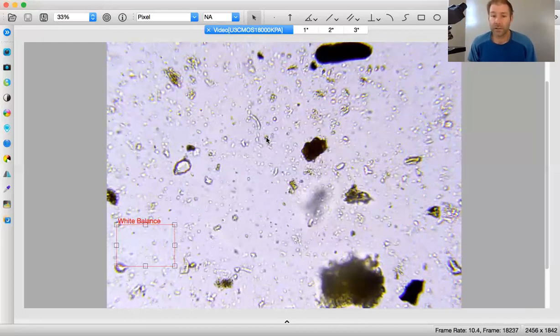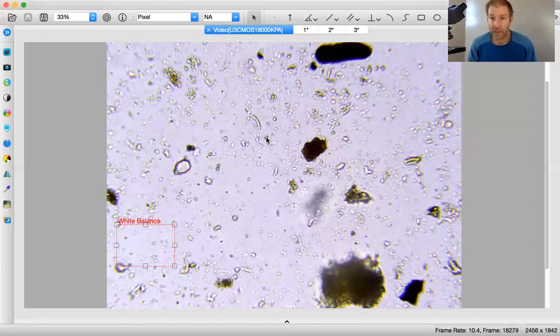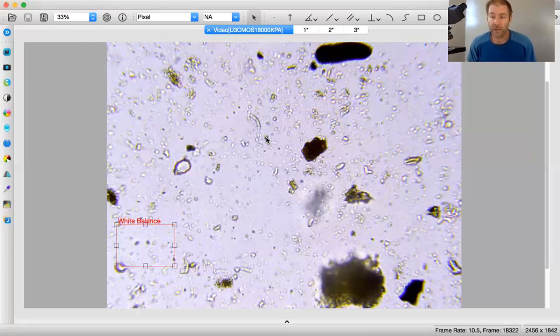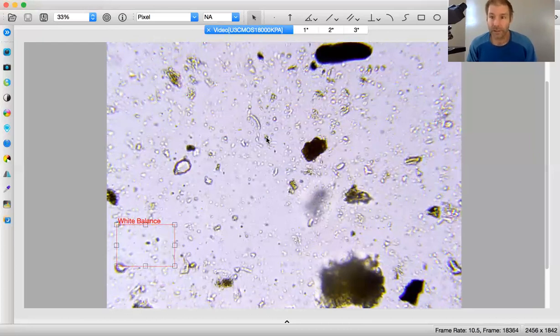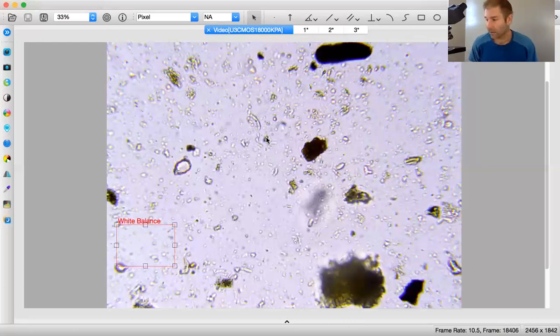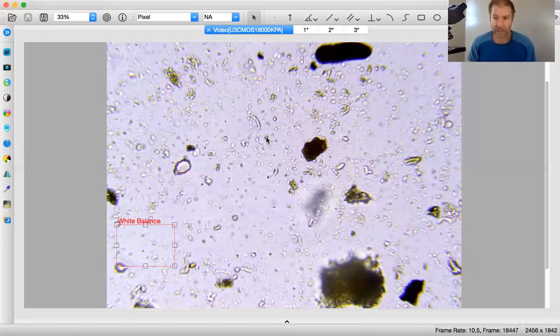But finding the soil that has the organisms in the first row and getting it dispersed right, and just doing everything that we need to do perfectly for this video is very stressful, and it's not exactly the easiest thing. I'm like on video 20 at this point, and I can't get perfection.